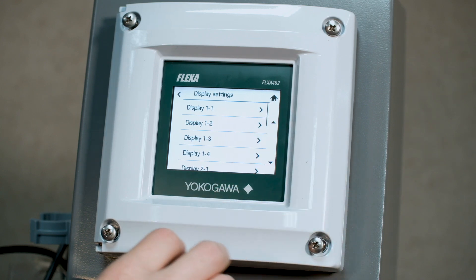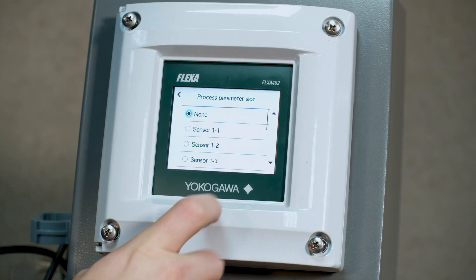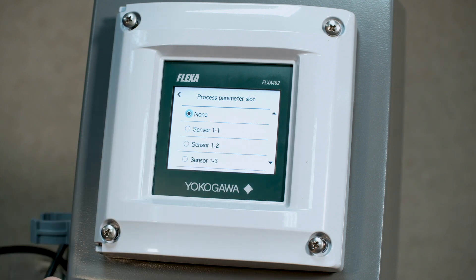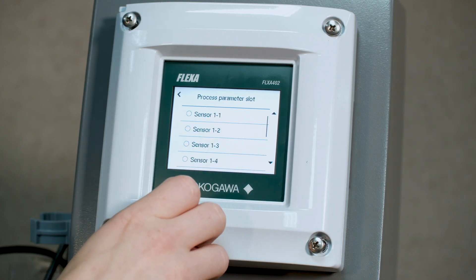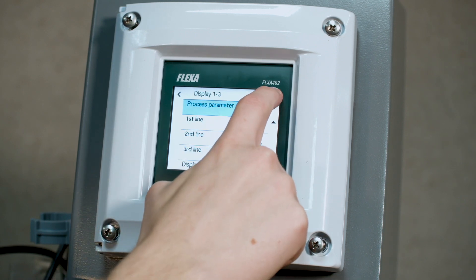Now we're going to go to display 1-3, and here we're going to set our process parameter to be sensor module 1, number 2. With the BA11, it will always be module 1, and then 1 through 4 will be how many are connected to the BA11. So we're going to do sensor 1-2 here. We'll do pH for now, hit save, and then go home.